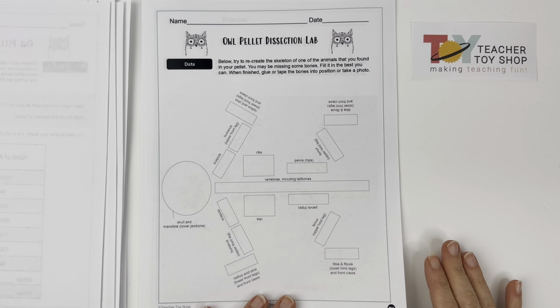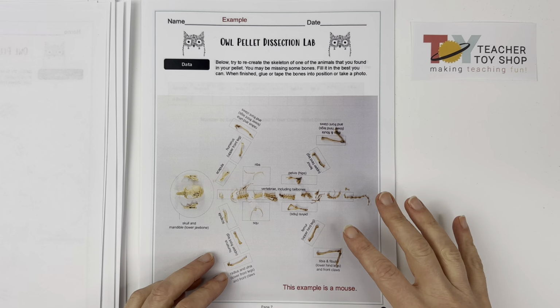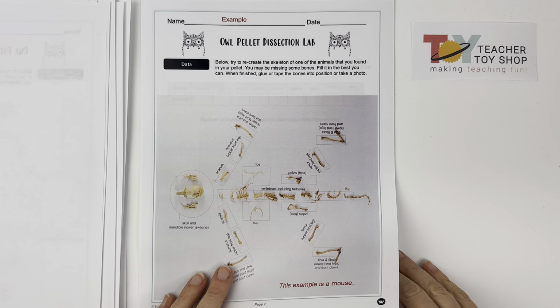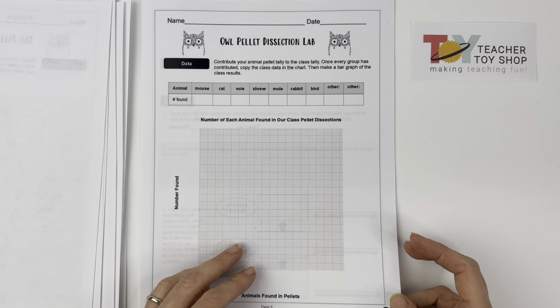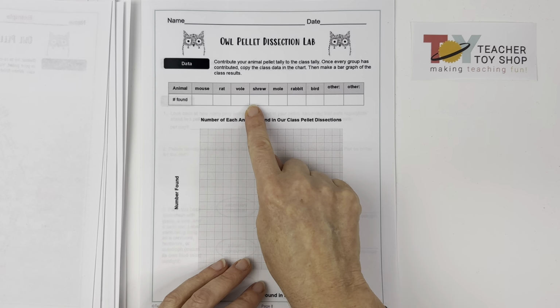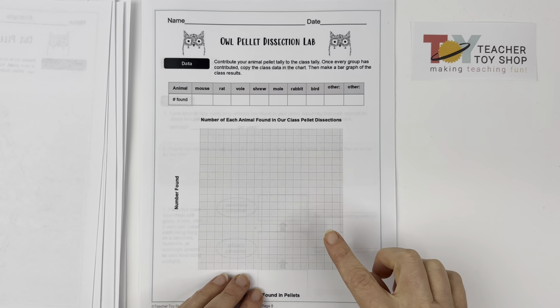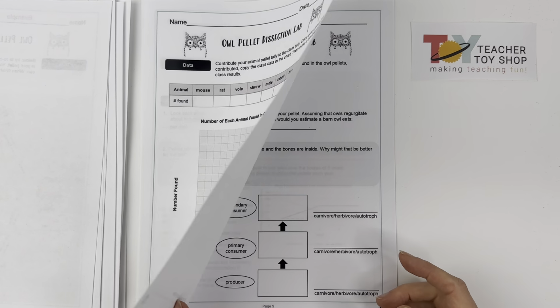They lay it out on this worksheet. I've provided an example of what you might see in terms of student work. And then as a class, you can have them use their data to tally up the class data and create a bar graph of what was found in the pellets.